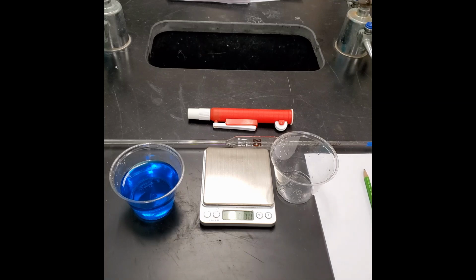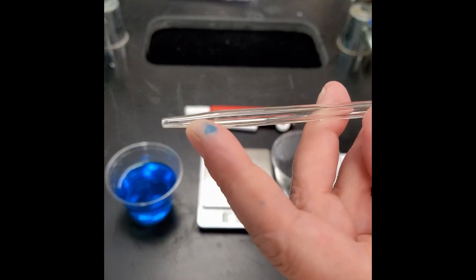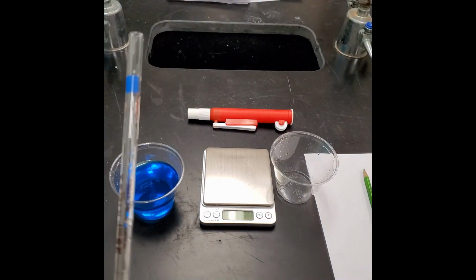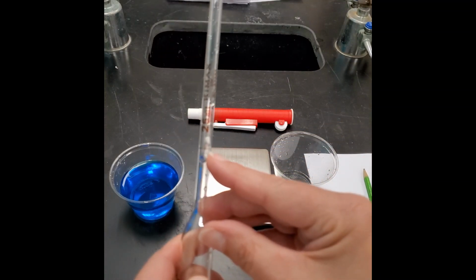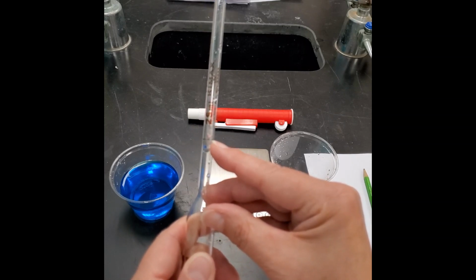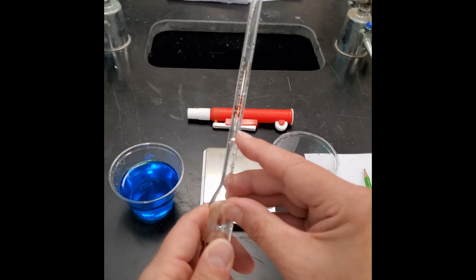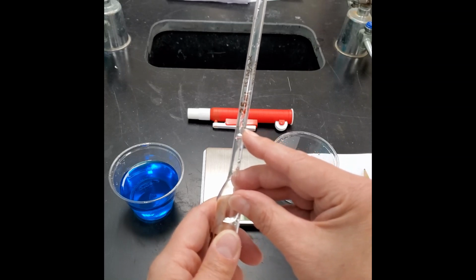Okay? Now let me talk a little bit about the pipette. This is the tip end, the end where the liquid comes out. Up here, at the top of the pipette, there is a ground glass line. Sometimes it's ground glass, sometimes it's marked. I'm trying to get this into focus for you. There's a line right here. That is always the spot where you want the bottom of the meniscus to be at this line. And once you've filled it up and gotten the meniscus to that line, then you know you have 25 milliliters.